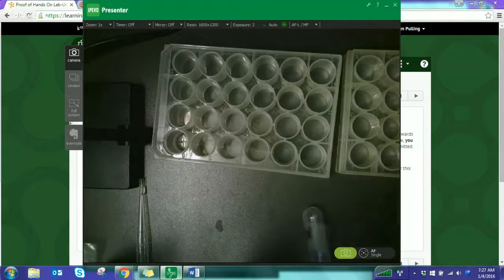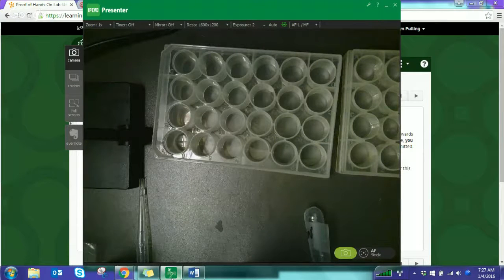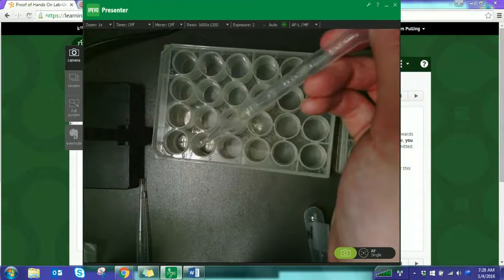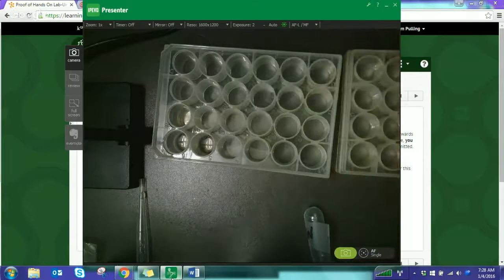All right, next one is going to be vegetable oil. And since it's just one liquid, we're going to do 10 drops, because you don't want these filled all the way to the top. If they're filled to the top, it's going to end up dipping your dot into the liquid, and then you're not going to have good results. So 1, 2, 3, 4, 5, 6, 7, 8, 9, 10. And again, make sure that with that vegetable oil, you just use that dropper with vegetable oil.